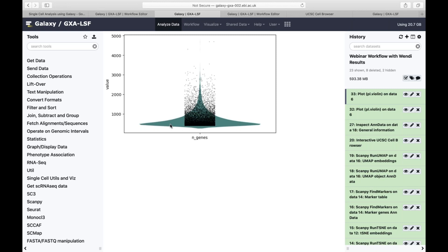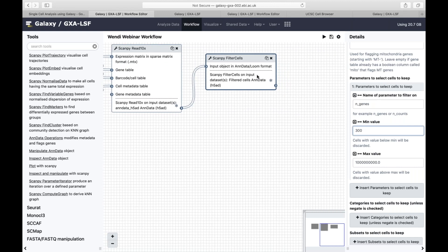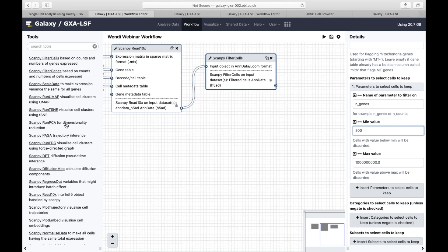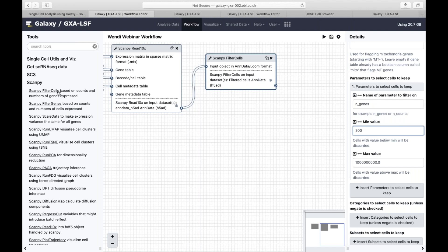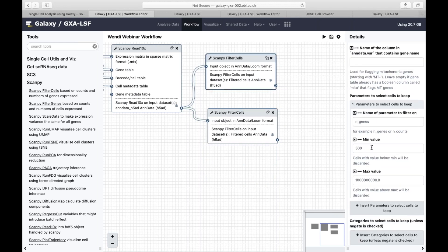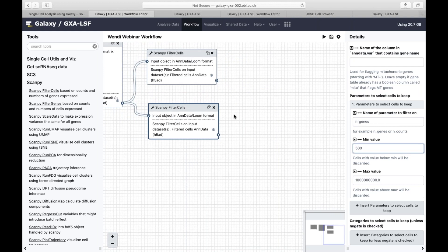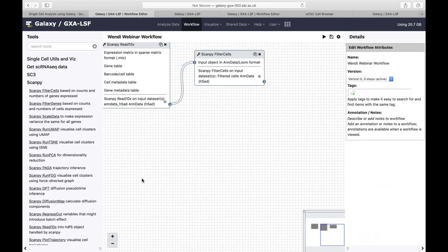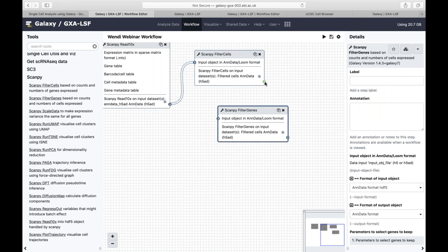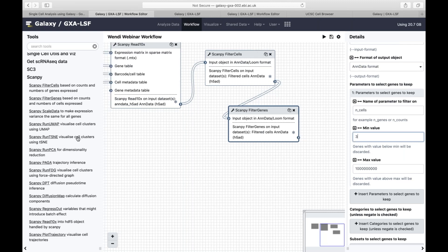There can be a lot of subjectivity, and some of the best advice is to try different things — if your output is consistent then you can trust it. Galaxy is particularly cool here because if you're doing this with code you might generate an image, save it somewhere, and later struggle to compare it with something from three weeks ago. With Galaxy you can chain it together and, for instance, compare what happens when you set your lower filter value at 300 versus 500, running them at the same time. We're now going to filter genes too — if a gene shows up only once in your entire dataset it's probably not informative, so we set a minimum value of around three.